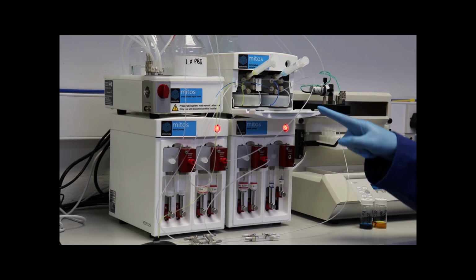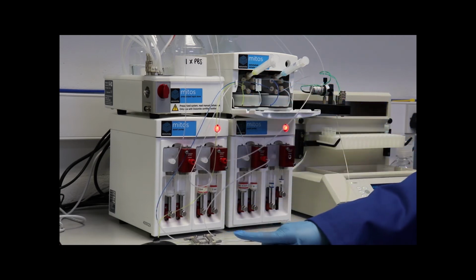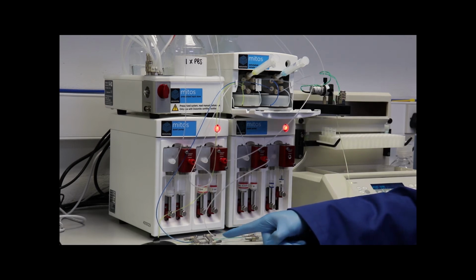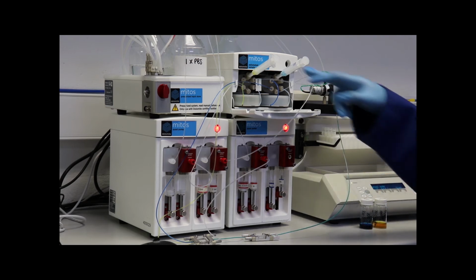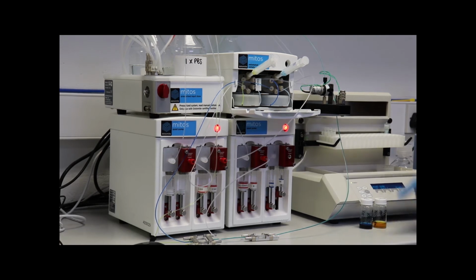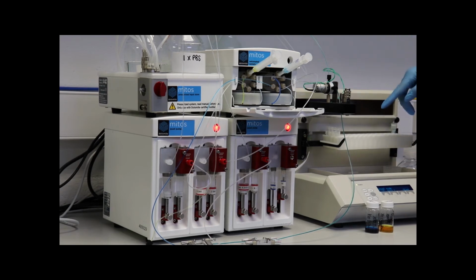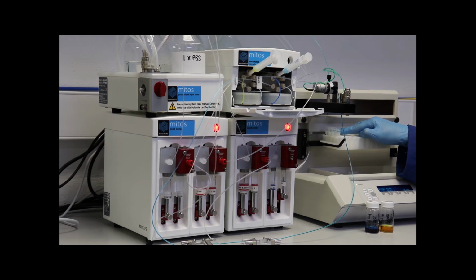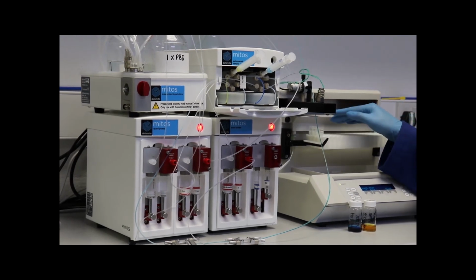You can probably already see the dyes are traveling towards the chip where they'll mix, and the final output is green. So we've got the blue and the yellow going towards our chip. Because we've told the system to remove the front 250 and the back 250, it's taken some to the waste, and now it's starting to collect. So we expect about 500 microliters to be collected. That's the first experiment done.